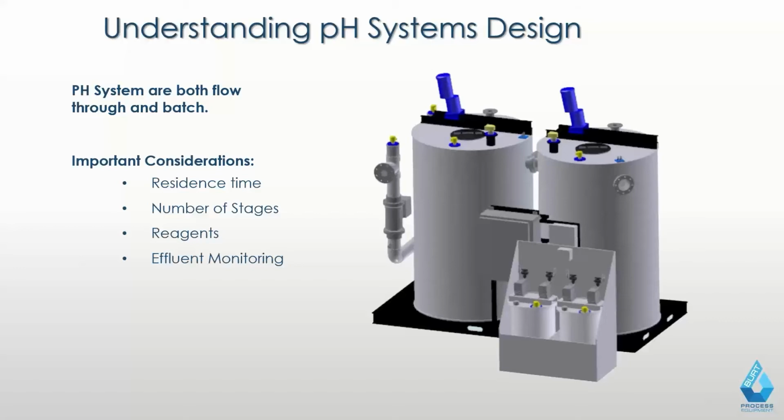So, Mark, I had another question for you at this point. I see in this graphic that we have the smaller reagent tanks offboard of the skid as the holding and treatment tanks. I was wondering, is there any benefit to having those reagent drums on board versus off board, and does it depend on the system? What are those qualities that go into that decision?